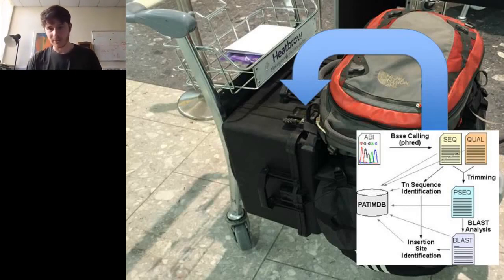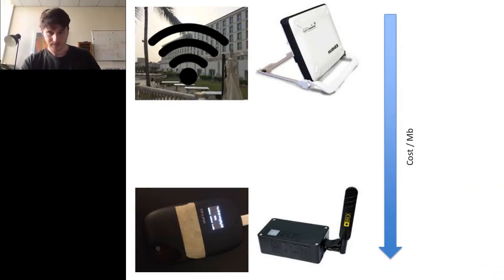So the final piece of the puzzle is the data analysis that we need to be able to do. We generated this data for these Ebola samples, and we needed to actually do the analysis, and that involved doing the base calling, which I talked about earlier, but it also involved comparing to other genomes and generating a phylogenetic tree.